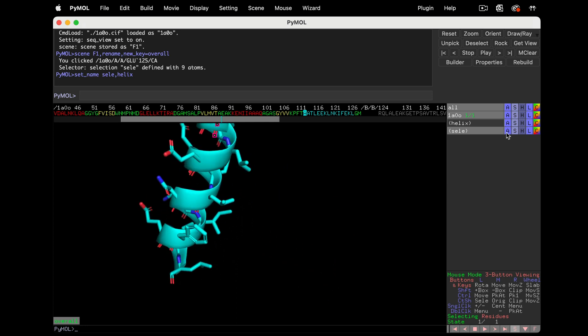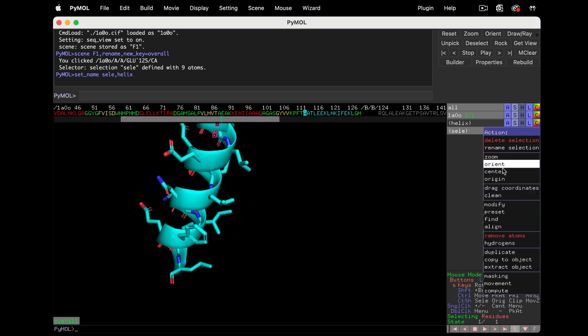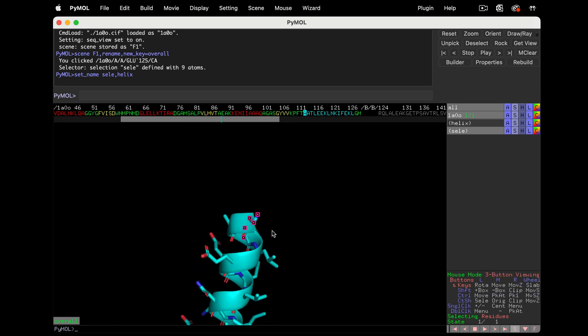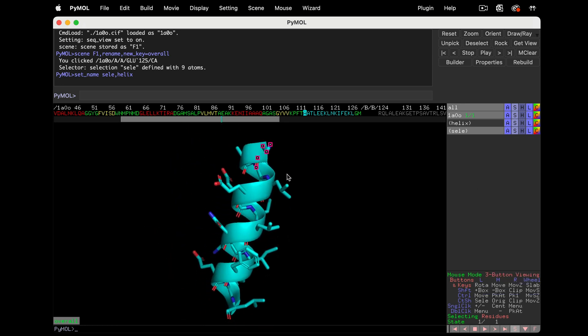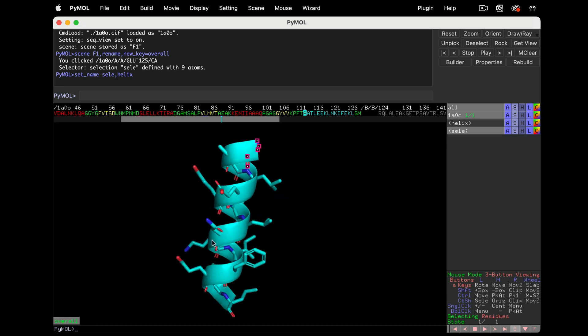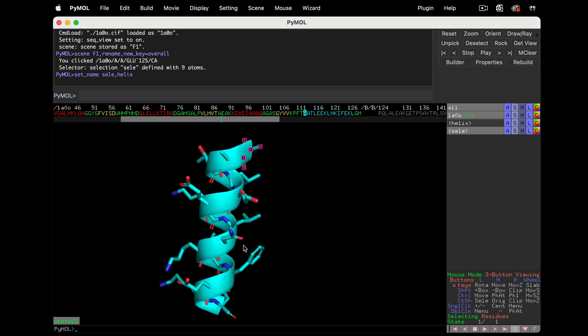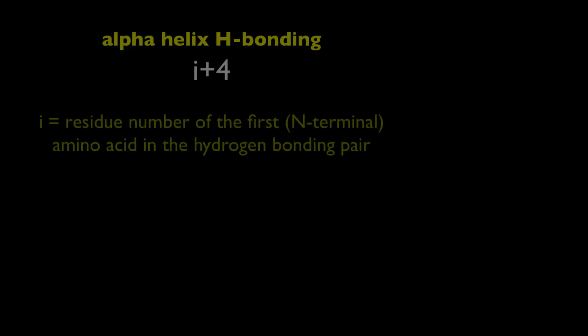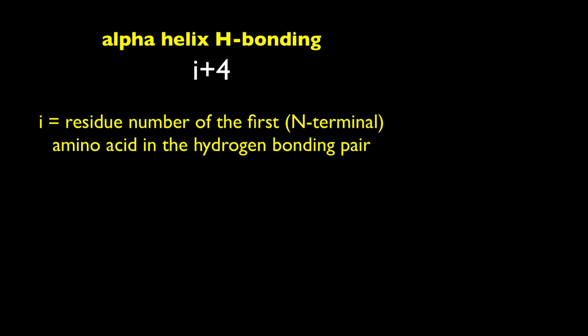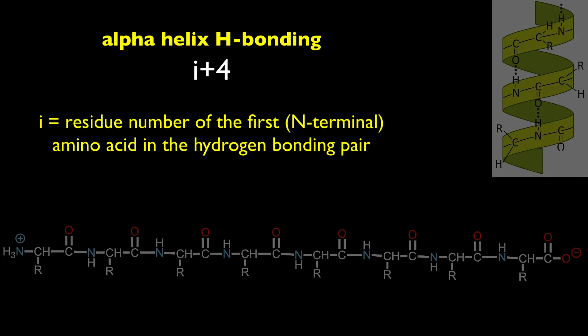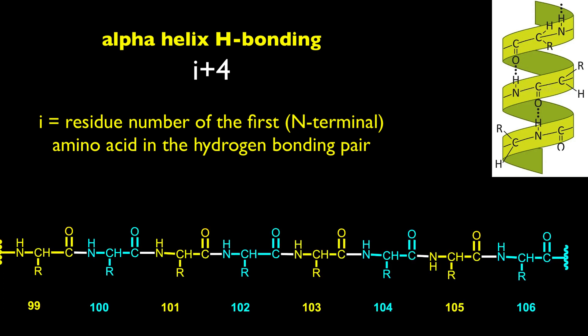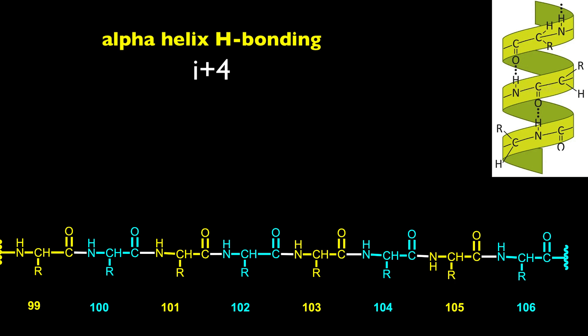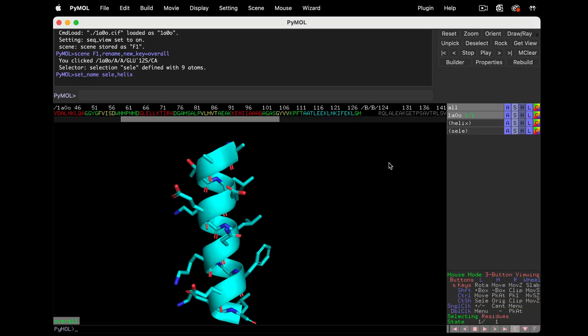All the backbone carbonyls, C double bond O groups, now point downward. They'll hydrogen bond to a nitrogen atom of another amino acid. If it's an alpha helix, the hydrogen bonding will follow an I-plus-4 pattern. This means the residue closer to the N-terminus hydrogen bonds to the residue that's four positions away. For example, if it's residue 100, it'll hydrogen bond to residue 104.